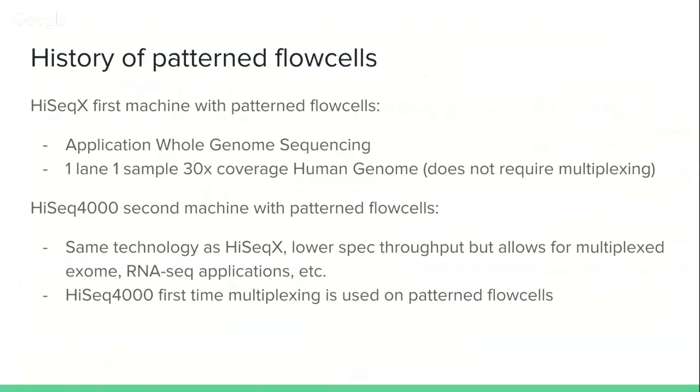Essentially, it was just a matter of putting your one sample in that lane, and that lane would contain all the reads from your sample, not from other samples.